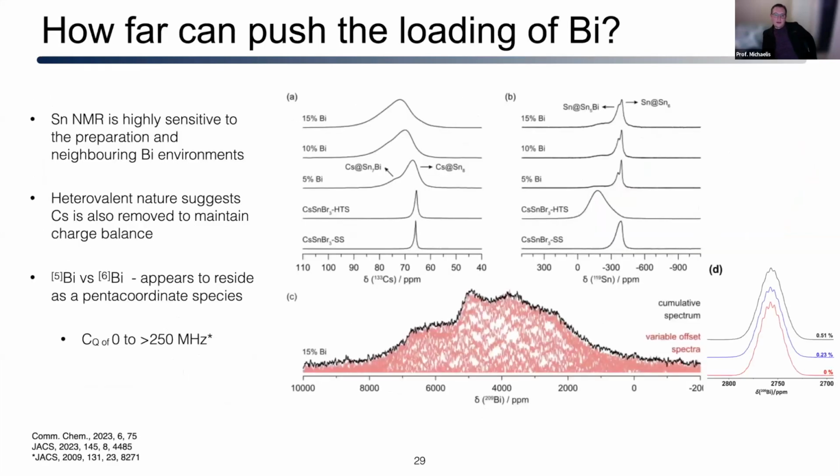NQR, yeah. Okay, so mainly the reason why we don't approach it that way, Jeff, is bismuth is a spin 9/2, and so if you basically scale it, the quadrupolar frequency, again, I don't know what the CQ is on this site. There might be a variety of bismuth sites in here, but the frequency gets too low for us to actually tune the probe to, so we can't really try it. Not something we like to admit, but we just can't do it.